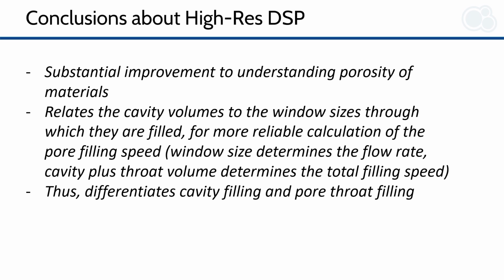And now we see the difference between pore throat and pore cavity filling, and have separate distributions for the pore throats and the pore cavities as a function of throat size.